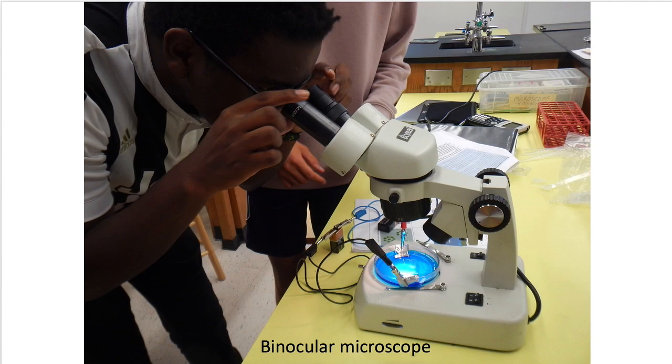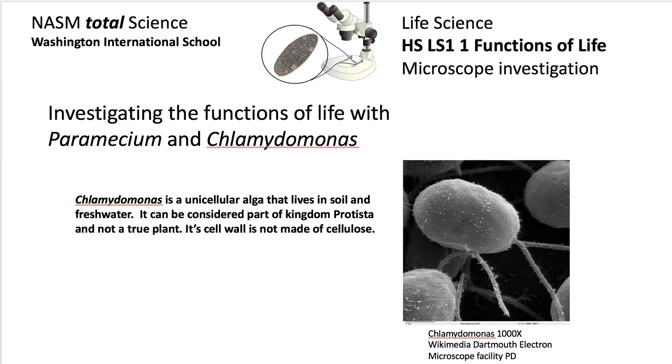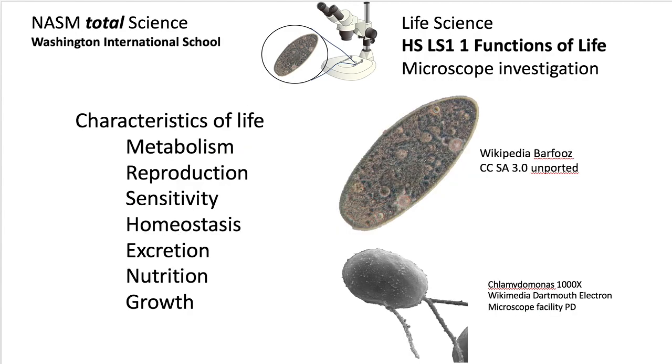And here we're looking at one of the experiments. And Paramecium, unicellular protist, Chlamydomonas, an algae, and yes, it's almost a plant too. We're going to look at these characteristics of life.